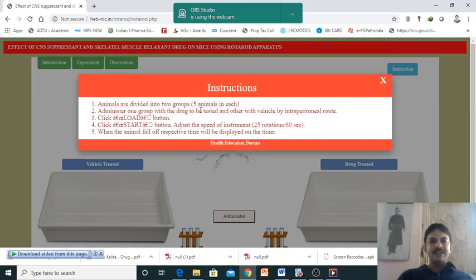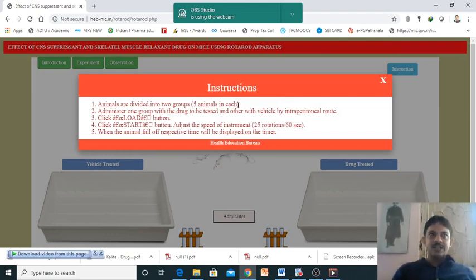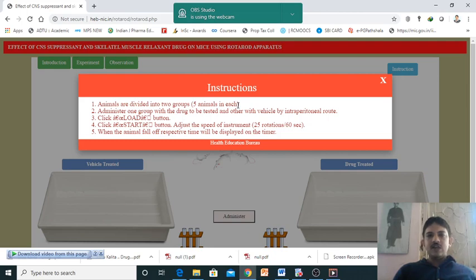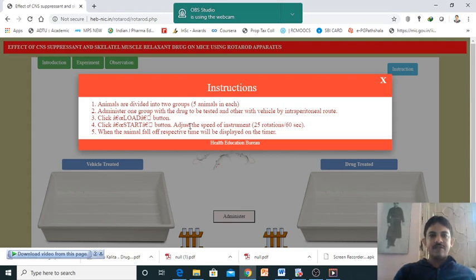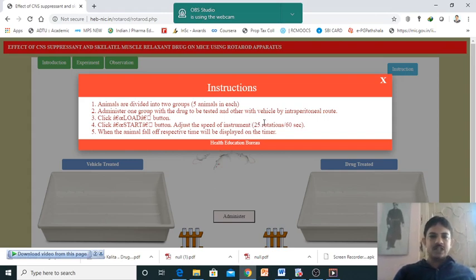Here it is given five animals in each group. I have told you in class that generally we take six animals per group for practical experiments. The drug will be given through the intraperitoneal route. Adjust the speed of the instrument - here it is considered as 25 rotations per minute.